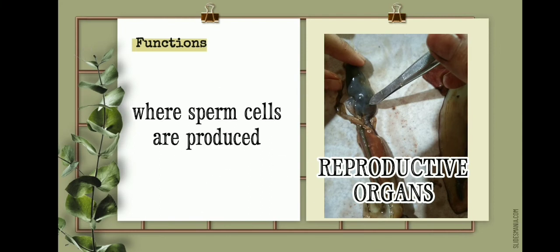The reproductive organs. The male has testes, from which sperm pass into a single gonoduct where they are rolled together into a long bundle of spermatophore. The gonoduct is elongated into a penis.